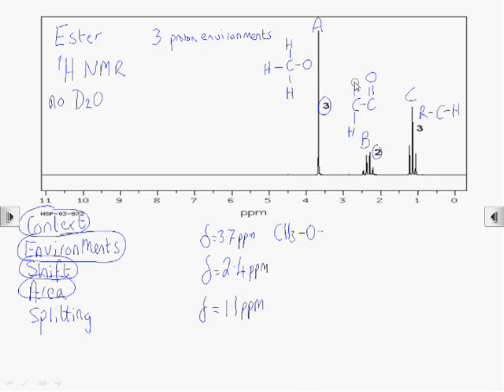There are two protons in environment B, so that's a CH2 group next to a carbonyl. And there are three protons in environment C, so that's an alkyl-methyl group.